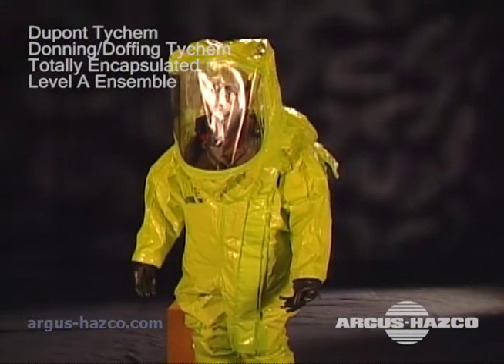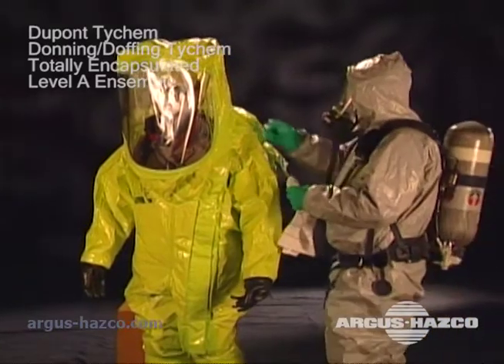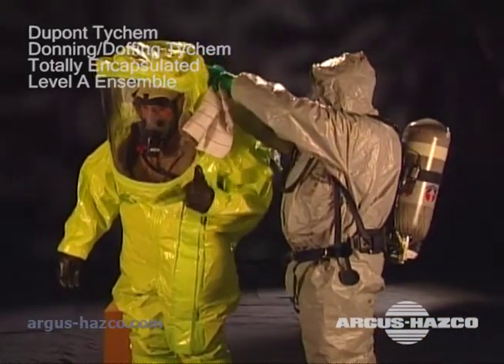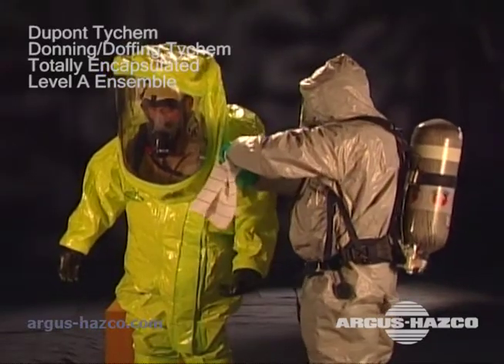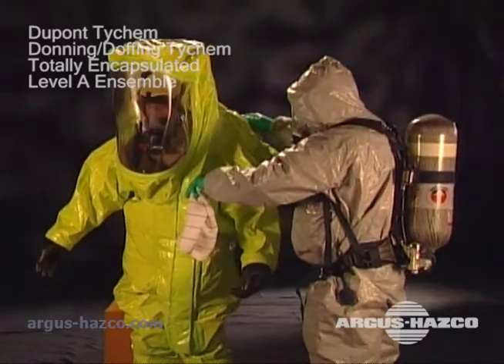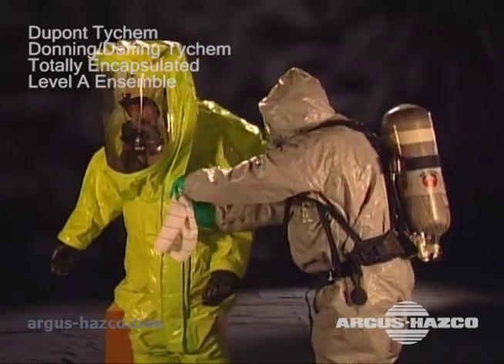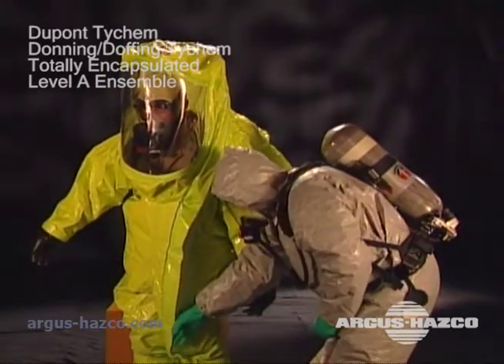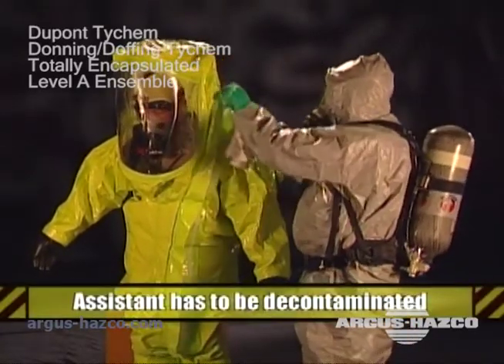Our worker has been decontaminated and is ready to doff his suit. The purpose of field decontamination is to minimize the potential contamination of the wearer as he removes the suit. Even though our worker has been through a field decontamination process, we're going to make certain our assistant doesn't get any contamination while helping him doff the suit. Once the assistant is finished, he too will have to be decontaminated.